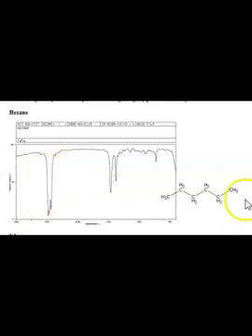So what does that tell us here? Well, this is our structure. This is the hexane molecule. Not a lot going on. There's no oxygen. There's no double bonds. But we have two things of interest that are going to show up on the absorption table. First, this is a methyl group that's hanging on the end. And what happens is when you have infrared spectroscopy, this thing can sway back and forth. We're going to see that that is indicated right here and here. There's actually two absorptions for that. So these two peaks tell us that we have that guy right there.